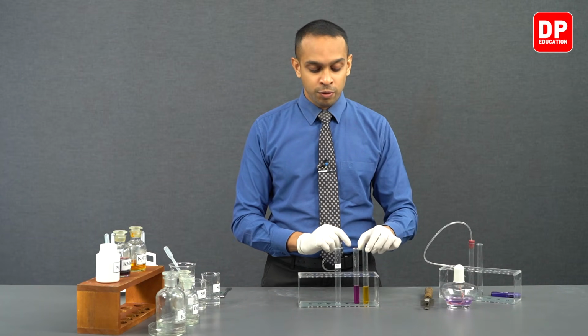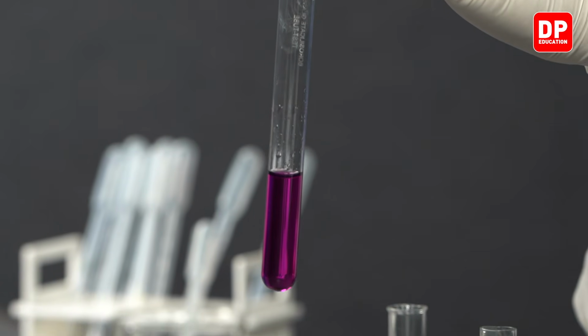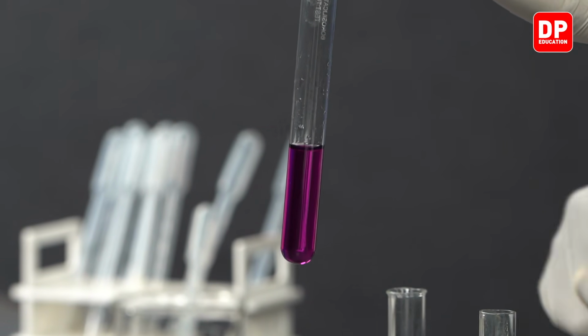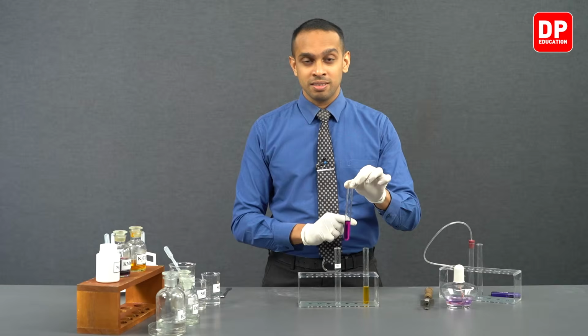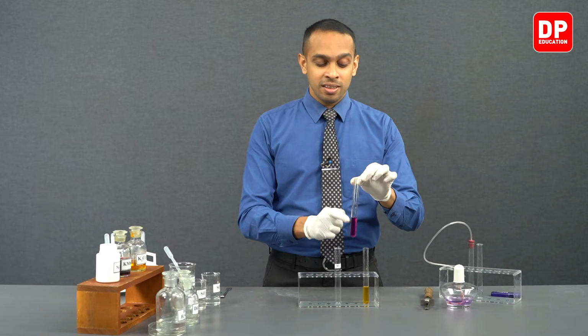And if you send sulfur dioxide gas through acidified potassium permanganate, you are going to observe the color of the acidified potassium permanganate changing from purple to colorless. As sulfur dioxide gets oxidized to sulfate ions, the permanganate ions that are purple in color get reduced to form Mn2 plus, which is observed as a colorless solution.